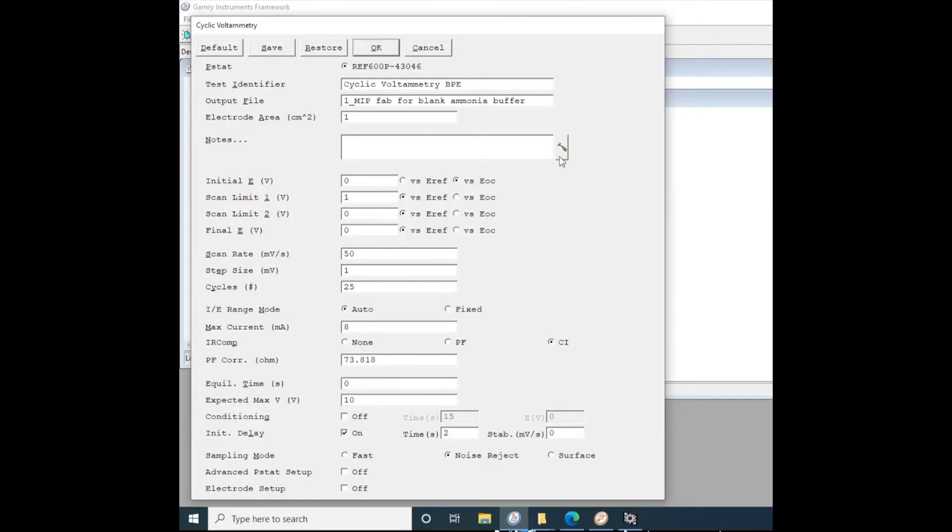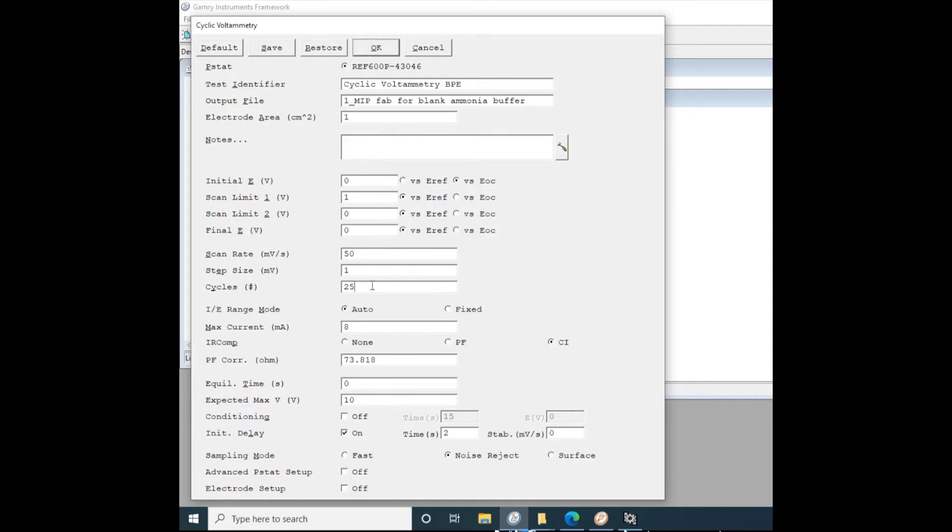You'll notice that initial E is selected as versus open circuit potential. That's important because it means you don't have to take a separate open circuit potential measurement. We're also IR compensating for this experiment. And then a cycle on the Gamry is twice as long as a sweep segment on the CHI potentiostat. So that's just something important to note.